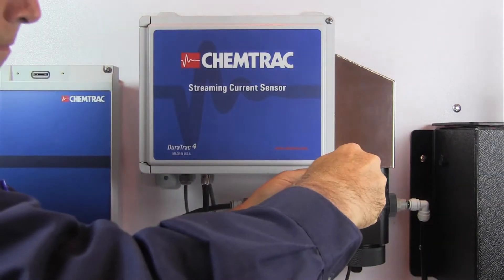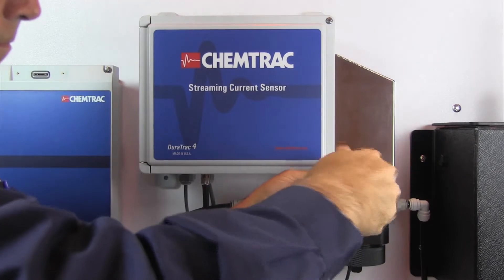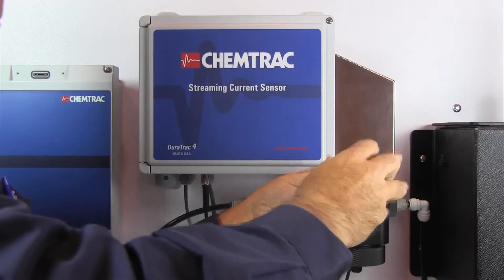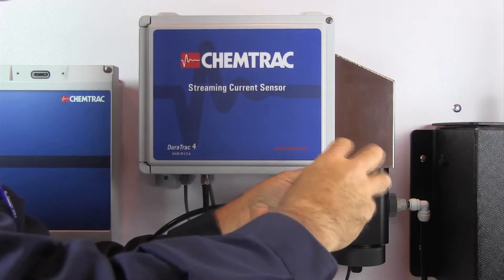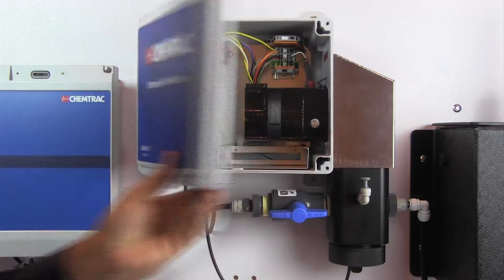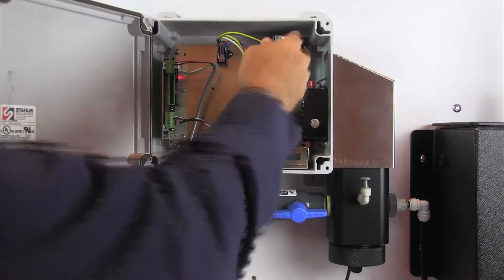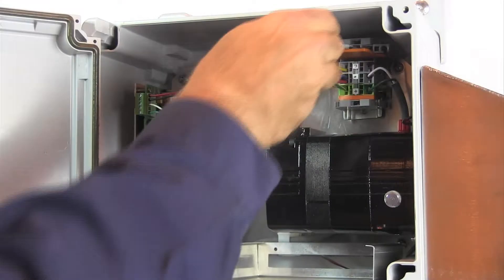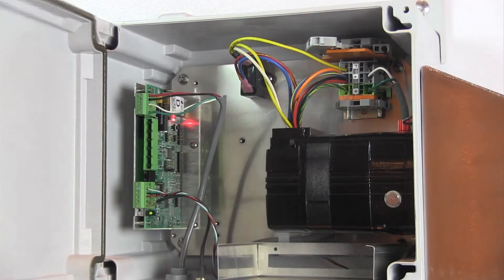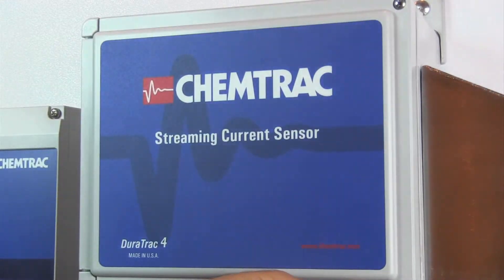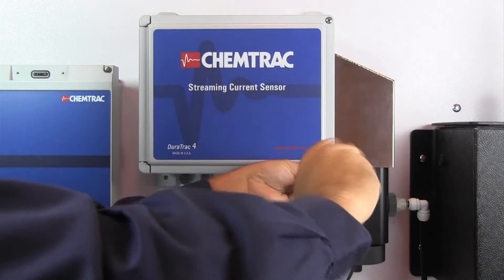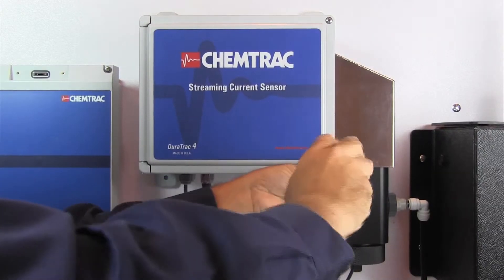When replacing the probe sleeve on the Duratrack 4 sensor, the unit should first be powered down, either using the internal breaker switch or by unplugging the power cord.